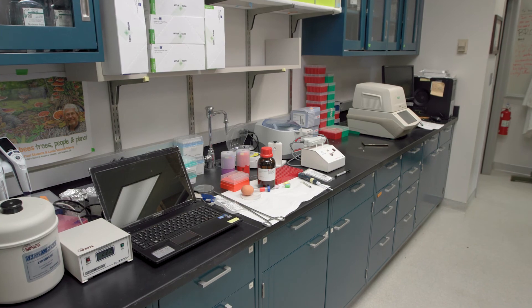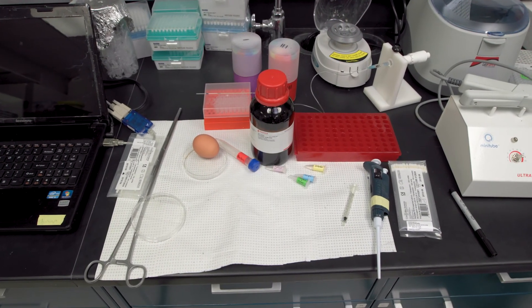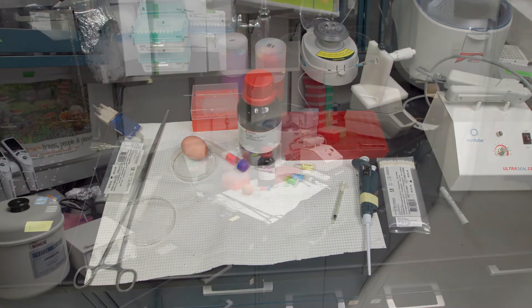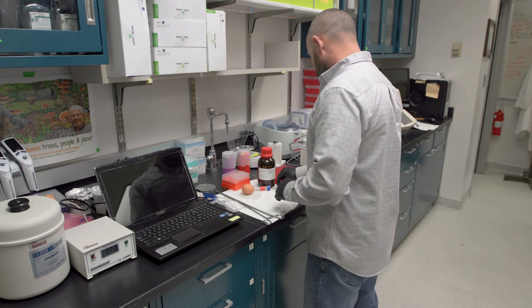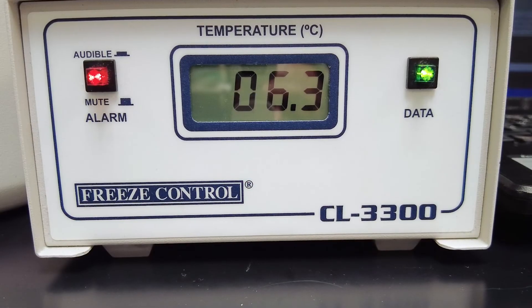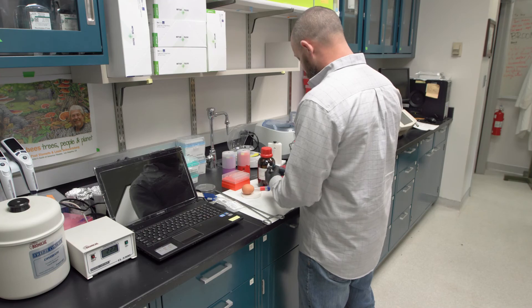In this video, we will be demonstrating one method of cryopreservation that was largely developed by John Harbo in the 70s and 80s at the USDA Bee Research Station in Baton Rouge. We use a controlled freezing rate utilizing DMSO as a cryoprotectant in a buffer containing egg yolk.